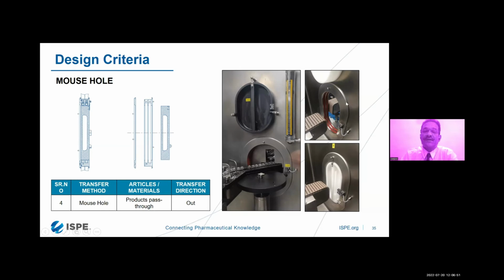The other chamber, which is at right angles and not required to be VHP sterilized because we are not going to do the lyophilized product on that particular day, we can close, and do the VHP whenever it is required, before loading the vials or before unloading the vials from the lyophilizer.